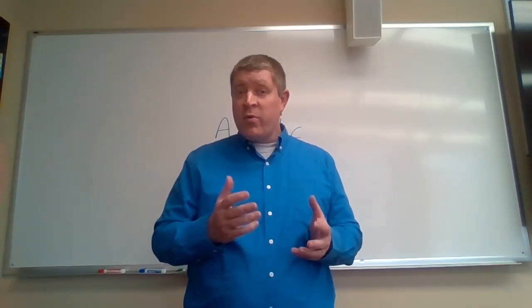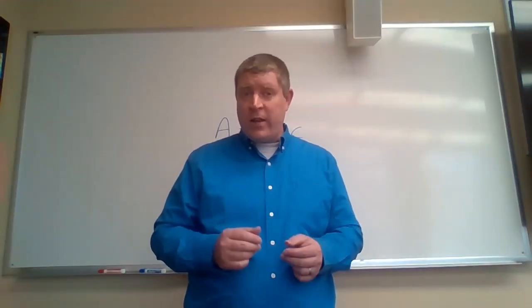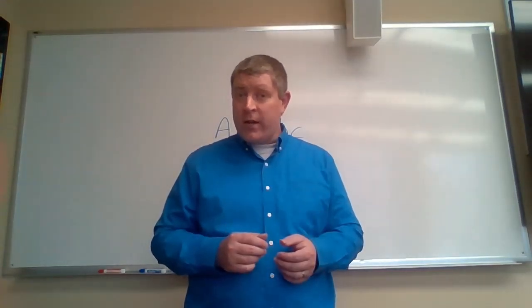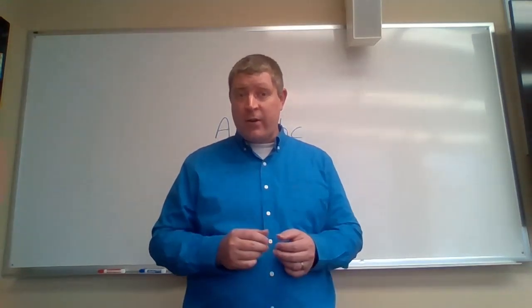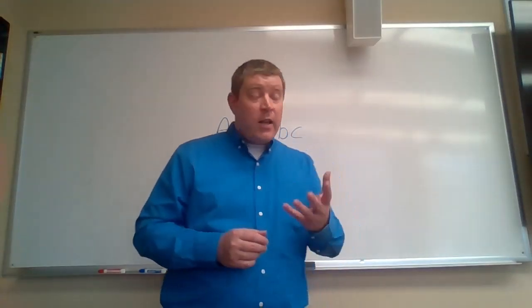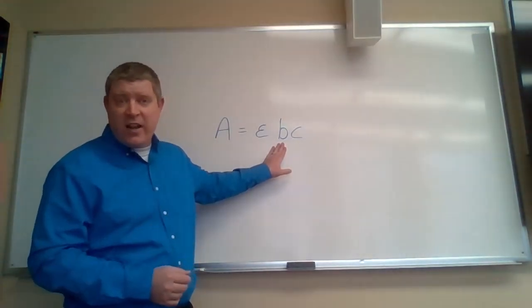Do you see your phone for a while, but it gets progressively harder and harder to see? Why do you see that? So when light of a specific wavelength passes through a solution, some of that light is going to get absorbed. How much light gets absorbed will depend upon three factors. The distance through the solution that the light has traveled. We call this distance the path length, and in Beer's law, we symbolize it with a B. Sometimes this is symbolized with an L to represent the length instead.